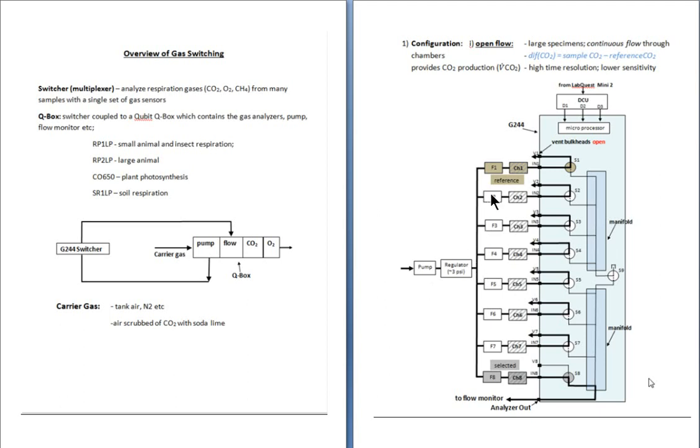When the gas comes out of the regulator, it's split into the various channels, passes into the flow meters, or as they're called, rotometers. They each have a valve used to control the flow, and they provide a visual measure of the flow as well. When the gas comes out of the flow meter, it passes into the chamber.